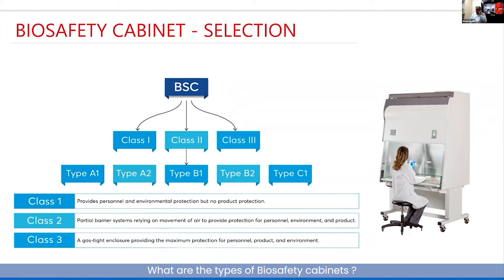Biosafety cabinets are classified into three distinct types: Class 1, Class 2, and Class 3. Within Class 2 there are subtypes A1, A2, B1, B2, and C1, which we will discuss as we go along to the next slide. Class 3 is the highest level of protection.